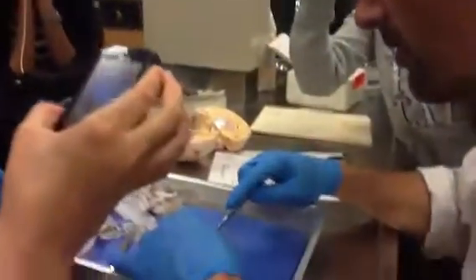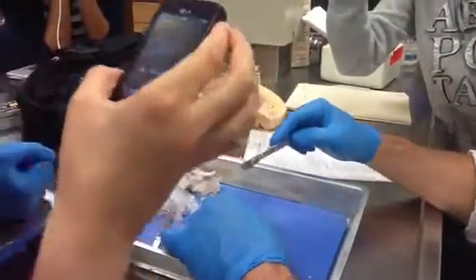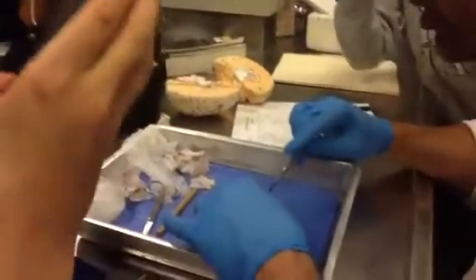I could just sort of let it go a little bit. I'm just opening it up a little bit at a time through the hemisphere. There's not too much to see there, but we want to get a nice cut through the diencephalon and that thalamus and the corpus callosum and so on.